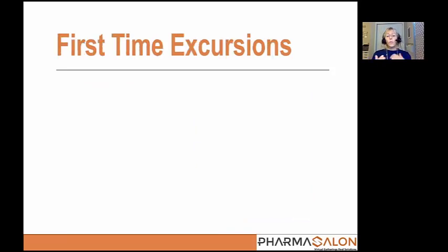So now we had some questions about excursions a little bit earlier, and I want to circle back to talk about what we're going to do if there are excursions. Now, I like to categorize these as first-time excursions and then consecutive and repeat excursions. It's not something that you see in the chapter described that way, and I'll walk you through what that means, but we want to talk through what to do if you do have excursions in your ISO 8 environment.